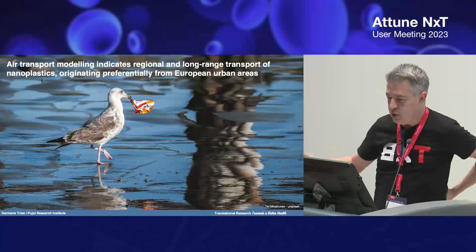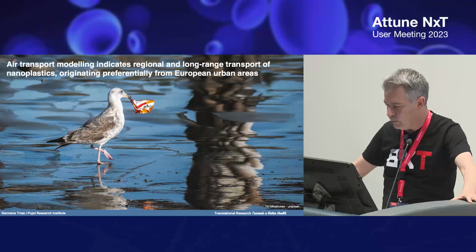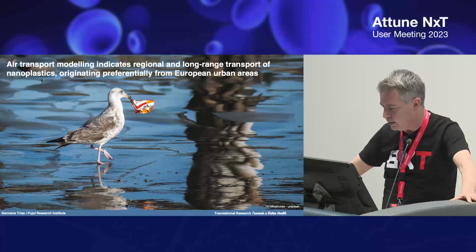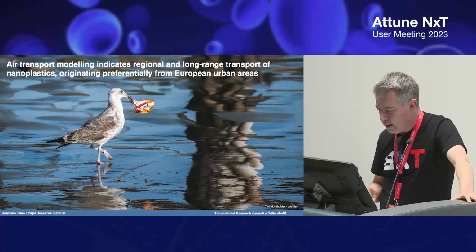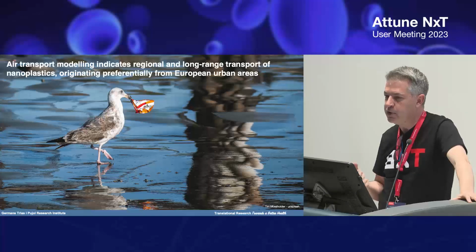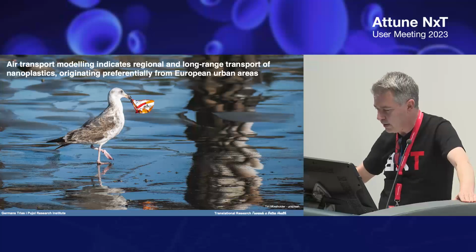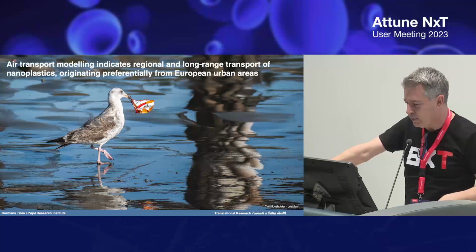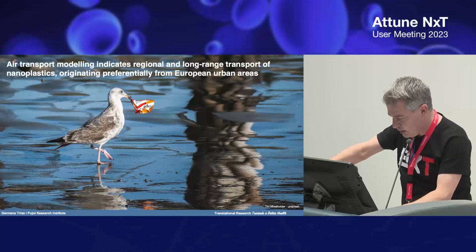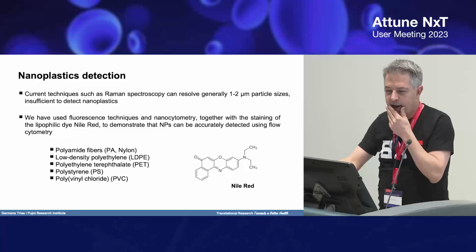And this is just to show you a different picture, because this is really common, how we are having an important impact on all the ecosystems all over the world. We were also interested in measuring plastic accumulation, not only in humans but also in water. I'm in contact with people from animal biology at the Faculty of Biology in Barcelona, and they will bring me water and ice from Antarctica, and we will try to measure the nanoplastic accumulation in this kind of samples.